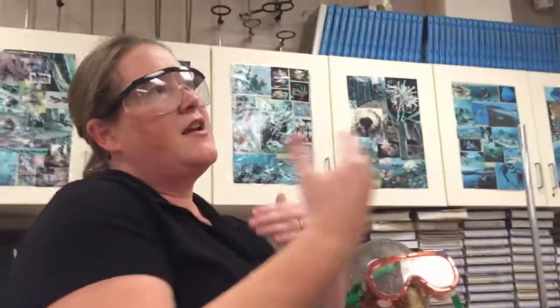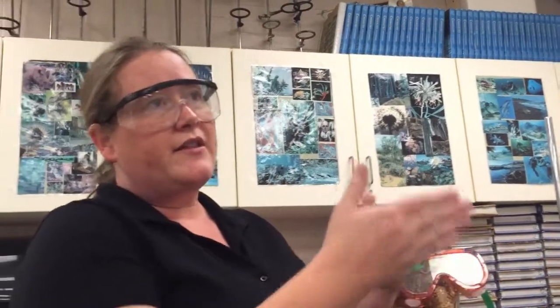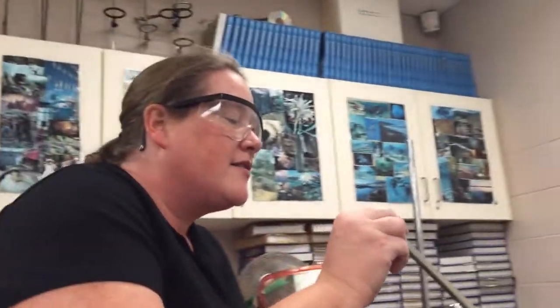and it indeed does. Most students thought that the mass would get less because they were thinking the copper would burn and it turned black, and we're familiar with things that are burning turning black. So it is a bit of a surprise that it does indeed gain mass, but I hope that it makes sense that when the copper and the oxygen are bonded together to form a new compound, since it has taken those oxygen atoms from the air, that it would get heavier.